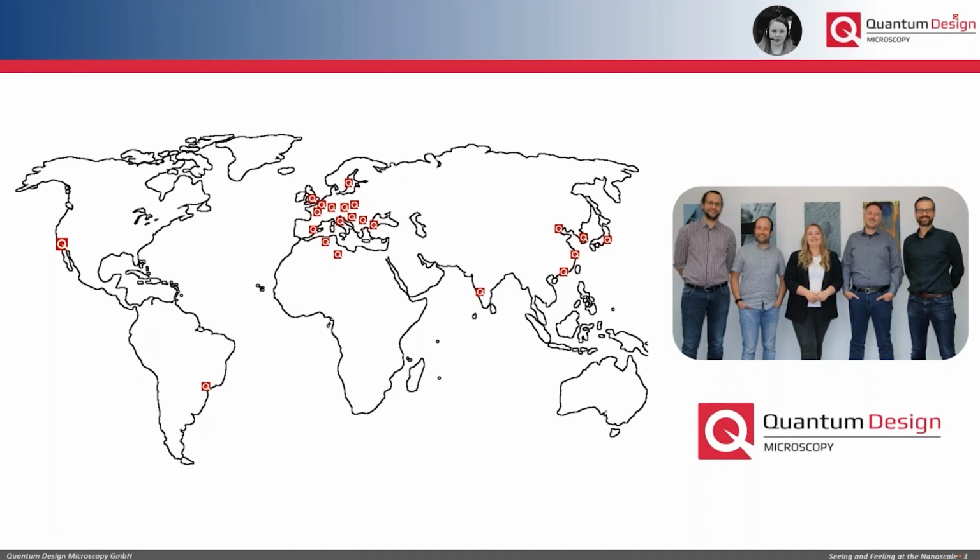Me and my colleagues are part of Quantum Design Microscopy, which is the newest addition to the Quantum Design network. We focus here on the further development of the tools for correlative microscopy.